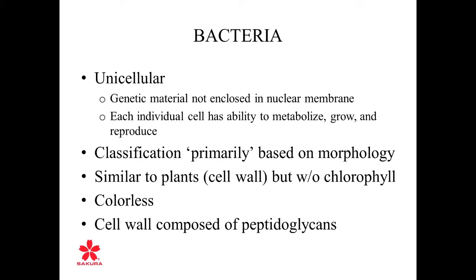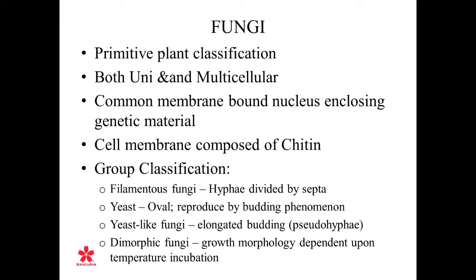They're basically classified in 4 different categories: gram-positive and gram-negative, as differential staining methods, that's 1. Acid-fast, that's 2. Silver methods, that's 3. And fluorescent methods. So these are the 4 different classifications of staining that are used when we talk about bacteria.